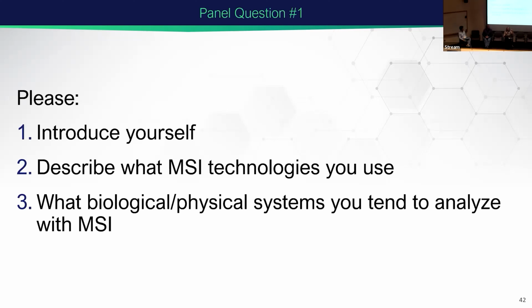So really, by being able to see everything spatially localized to different things, that's the power that EMSL is offering. If you imagine you just crush up that whole tissue, you homogenize it all up, you're going to dilute out your small, really important factors that might only be in little tiny regions, and you might not get the answers that you want because you're going to mesh everything together.